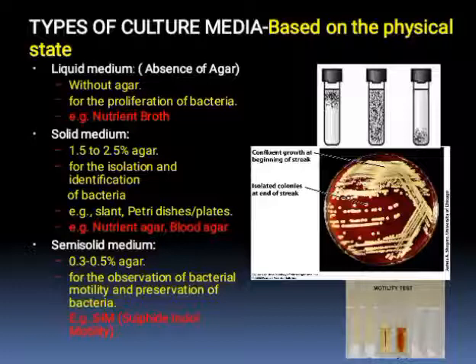Number 3 is semi-solid medium. Semi-solid medium contains 0.3 to 0.5% agar. It is used for the observation of bacterial motility and preservation of bacteria. An example of semi-solid medium is SIM, or sulfide indole motility.